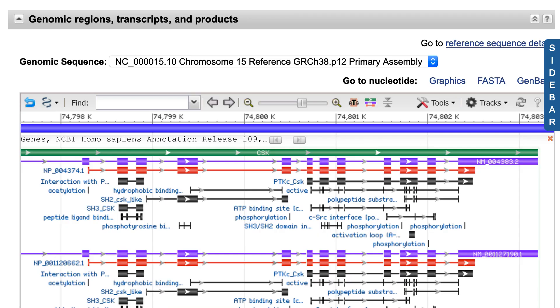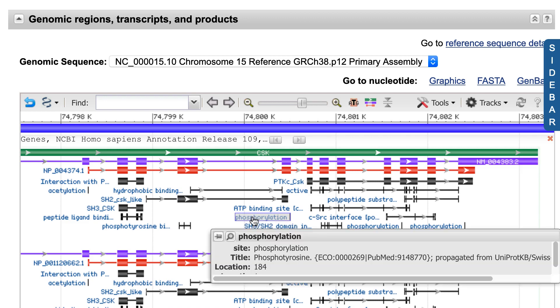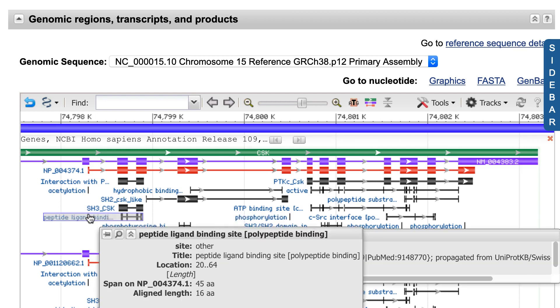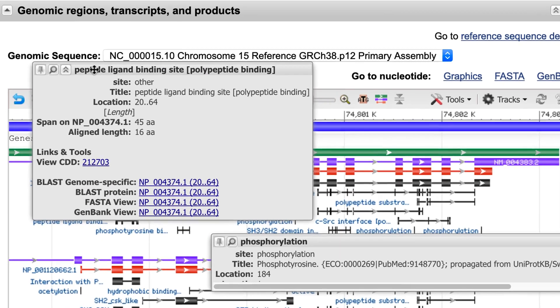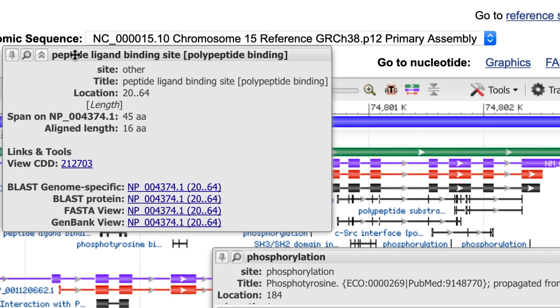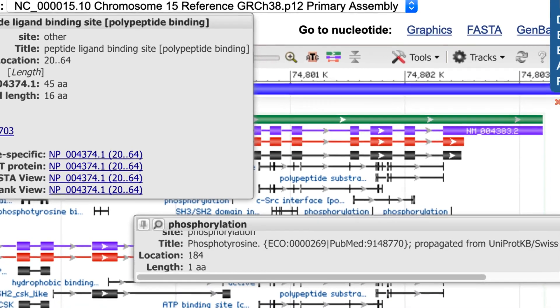By selecting product features, you see annotated features on the protein product, such as phosphorylation sites and conserved domains. As you saw, a mouse over gives you a tooltip with more information, such as the source of the feature annotation.